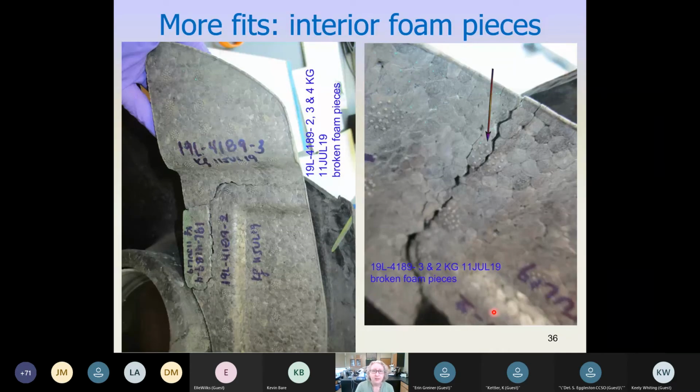Now, again, the officer was really on the ball here because they not only collected that obvious piece of painted bumper for paint work, but they also collected at the scene 2 pieces of broken gray foam. And this is very common. You've probably seen this type of foam insulation inside a bumper of a vehicle that you own or you've seen damaged. However, this one did throw us for a bit of a loop because there were some spots of green paint on the pieces from the scene, but there was no green paint on the foam insulation on the bumper when it came into us.